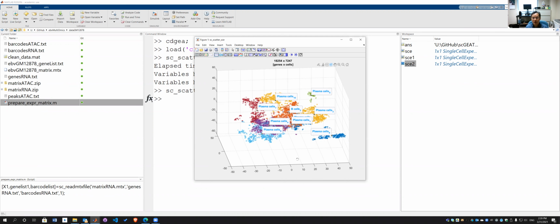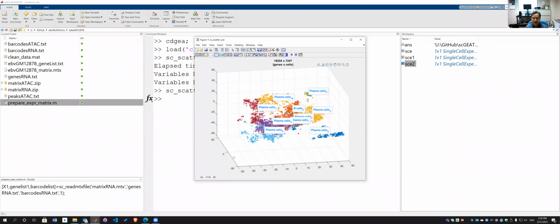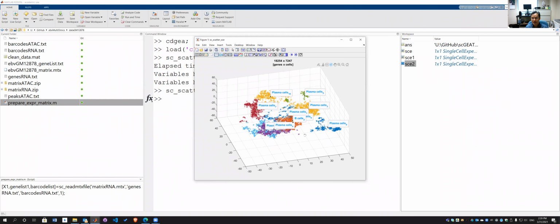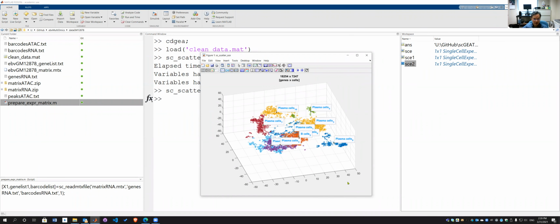At this moment, I want to know whether you have any questions and what you expect to do with your data, any suggestions we need to address here before I move on to another section. Do you find any bugs in the program when you run it, or does it crash? If you do, please let me know, because I can fix this online, and you can have a new installation. You should be able to work with the new version.